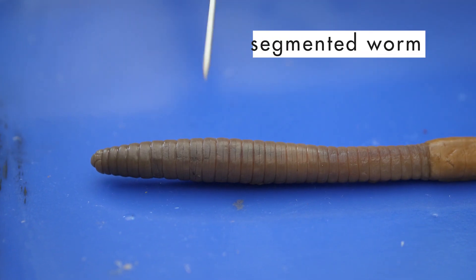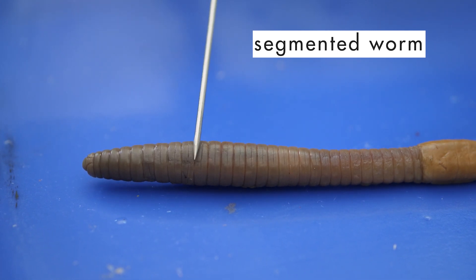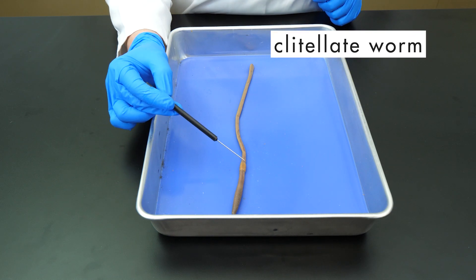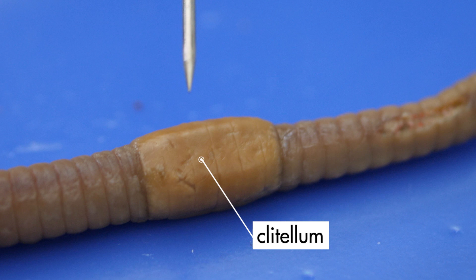The earthworm is a segmented worm — we can see that its body is divided into many segments. The earthworm is also a clitellate worm, which means it has a clitellum. The clitellum aids the worm in reproduction.